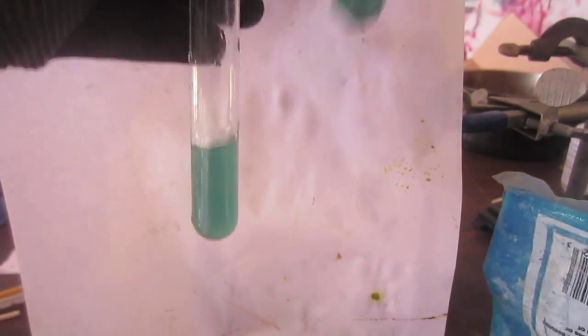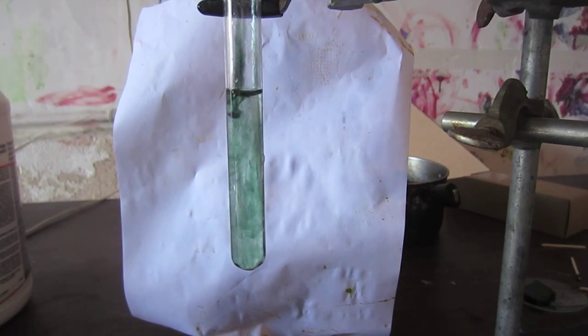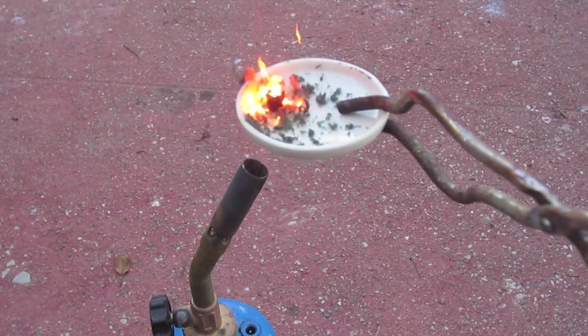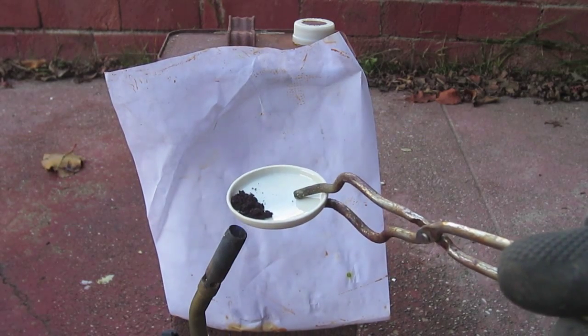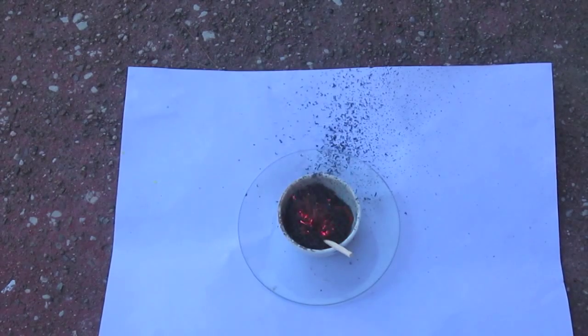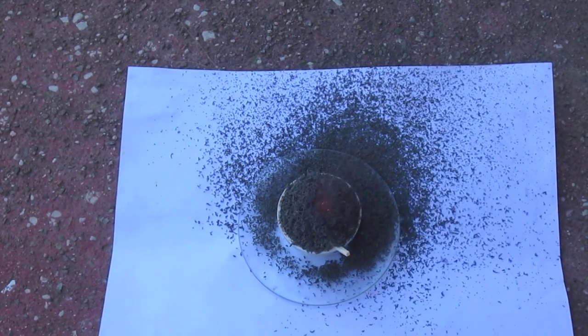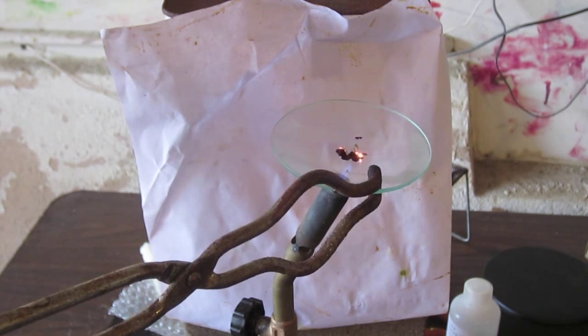All right, now I've shown you chromium in all the major oxidation states that can be easily reached: plus 2, plus 3, plus 4, plus 5, and plus 6.